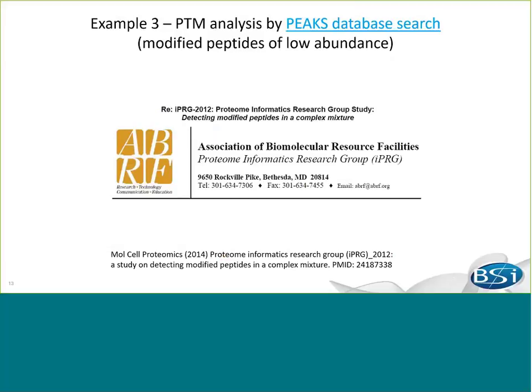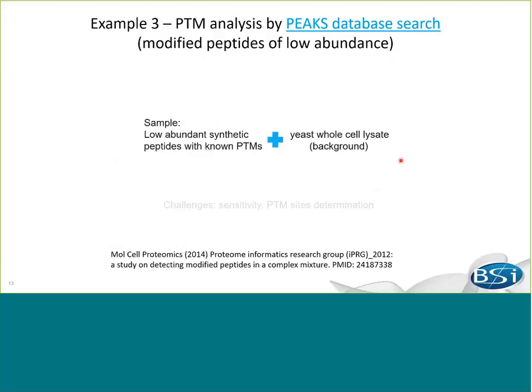In 2012, we participated in a study hosted by the iPRG of ABRF, which aimed to assess various software's ability to handle these situations. They used a sample comprised of a mixture of synthetic peptides containing known PTMs, spiked into a yeast whole-cell lysate as background. And this dataset is the third example that I will show you.